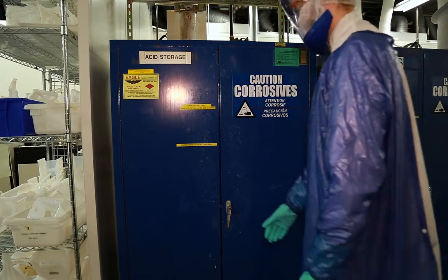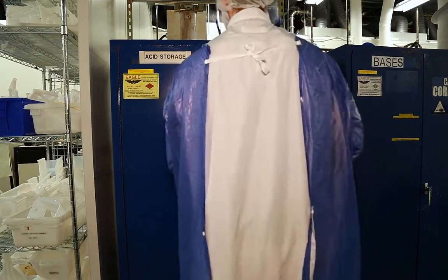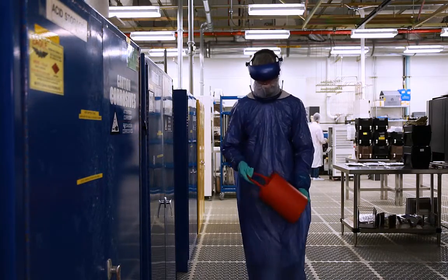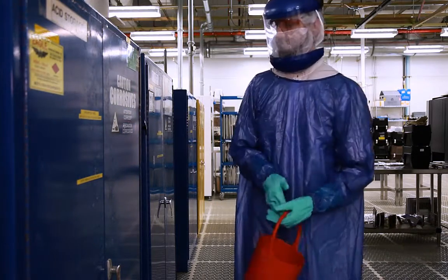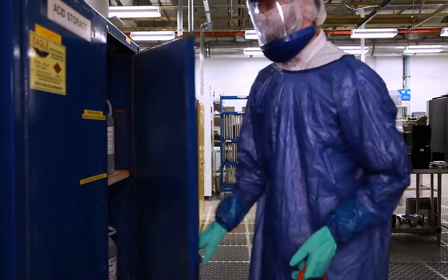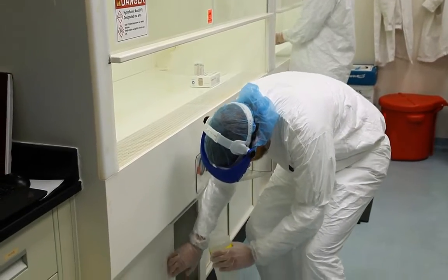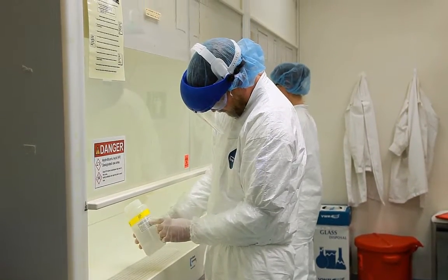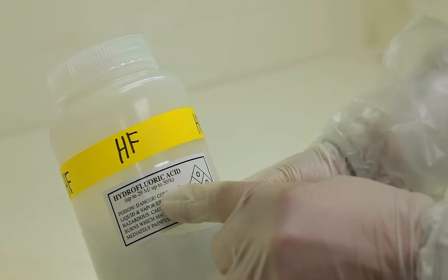Prior to purchasing, carefully consider the volume of HF you are able to safely store. Purchase and use the concentration of HF required for your experiment to avoid an unnecessary risk associated with dilution. HF must be stored in approved vented cabinets, separate from incompatibles. Secondary containment is highly recommended.